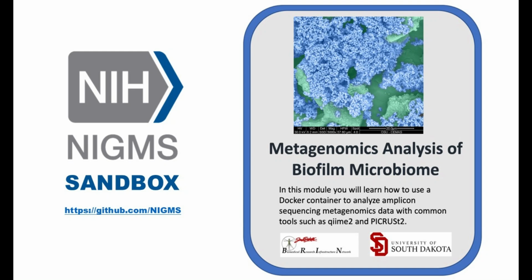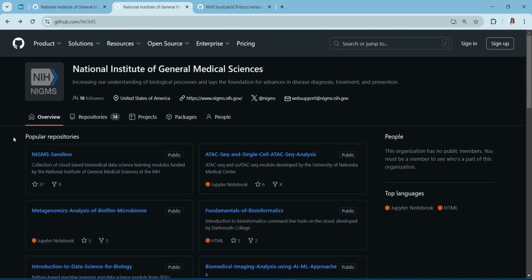Welcome to this guide on navigating the metagenomic analysis of biofilm microbiome module on the NIGMS Sandbox. My name is Sonalika and today I'll walk you through how to access and utilize this module effectively.